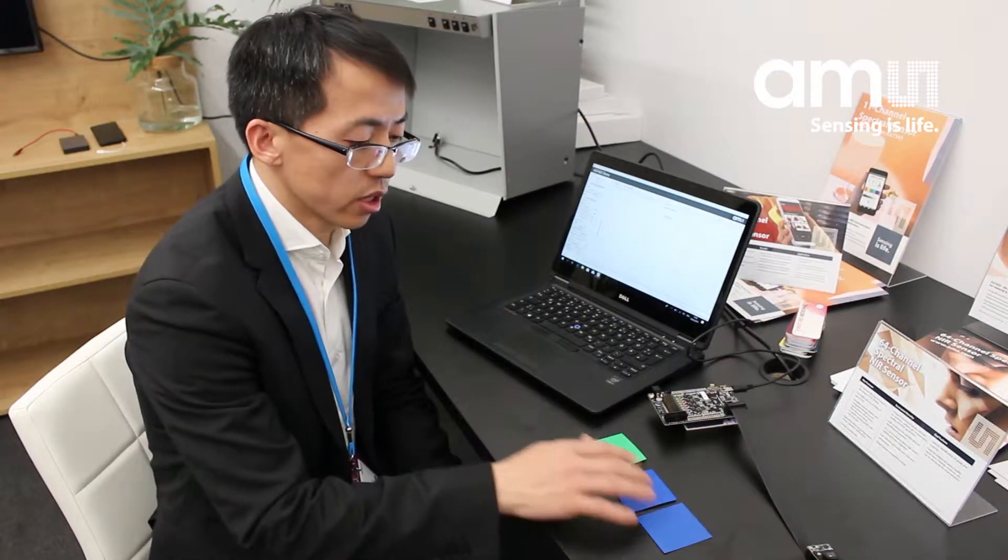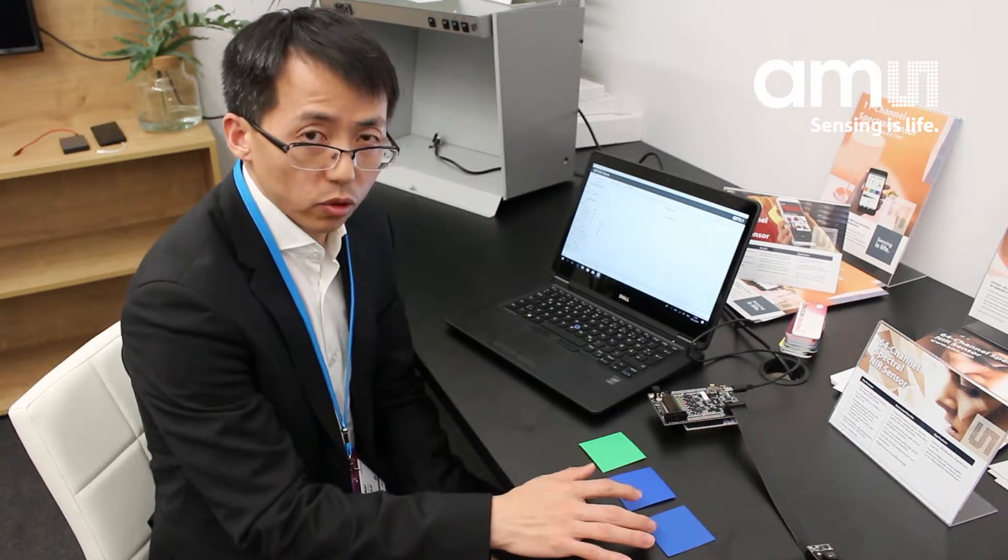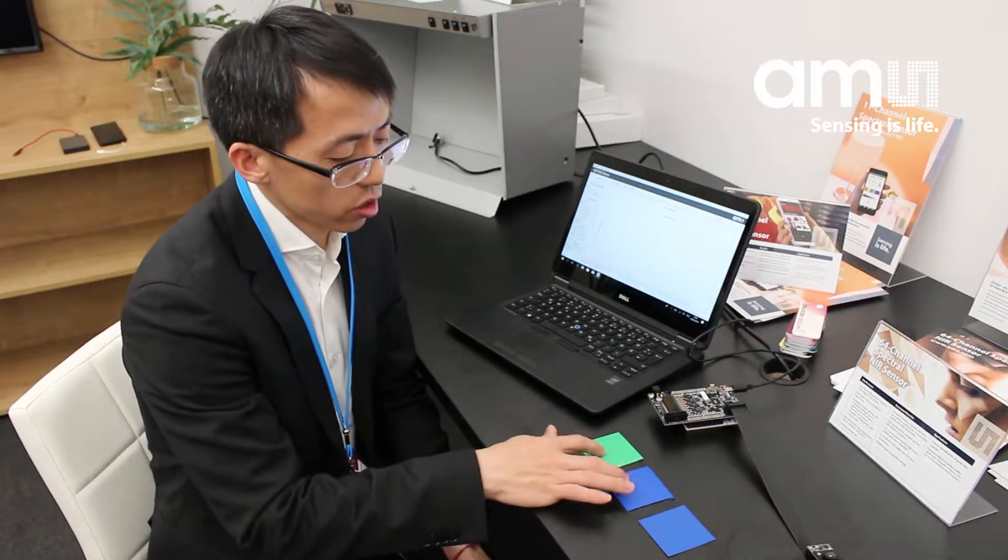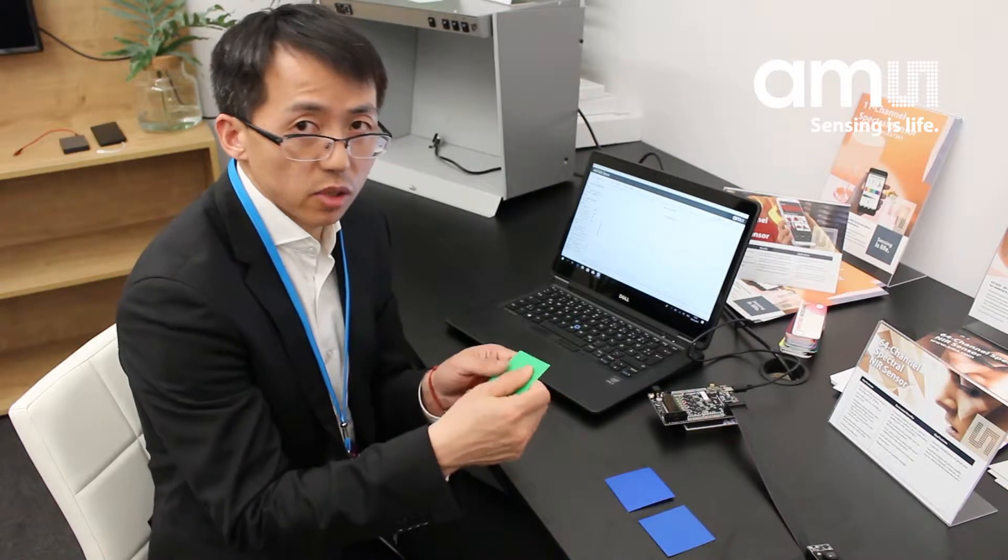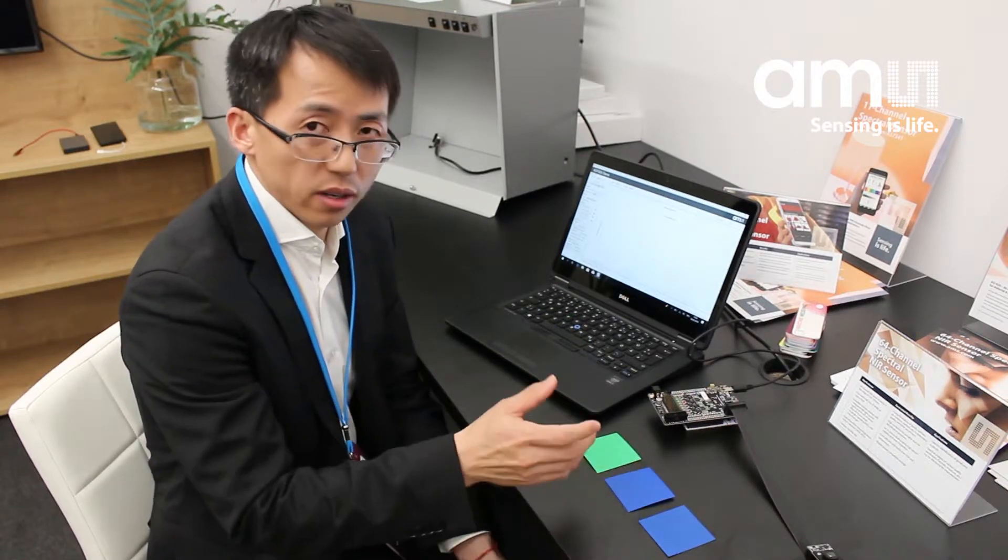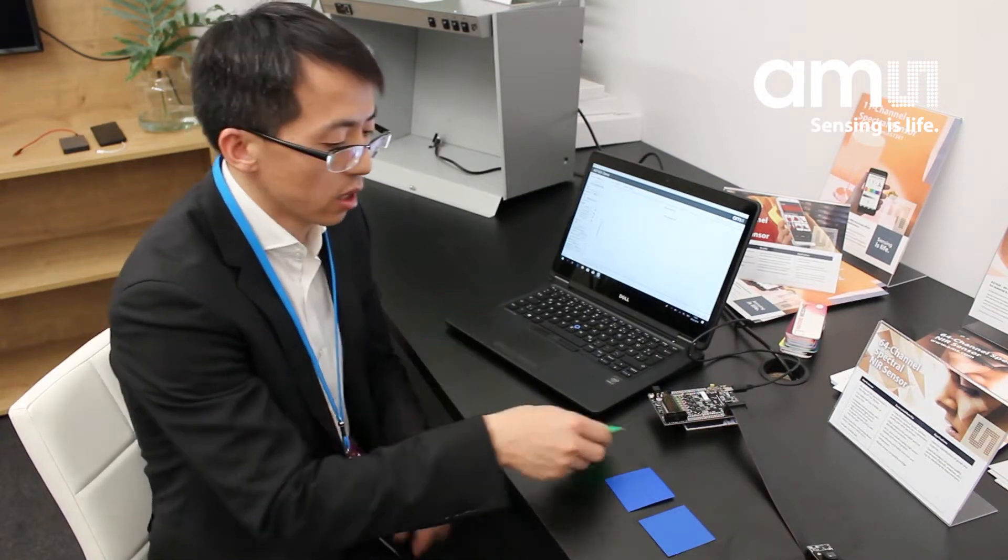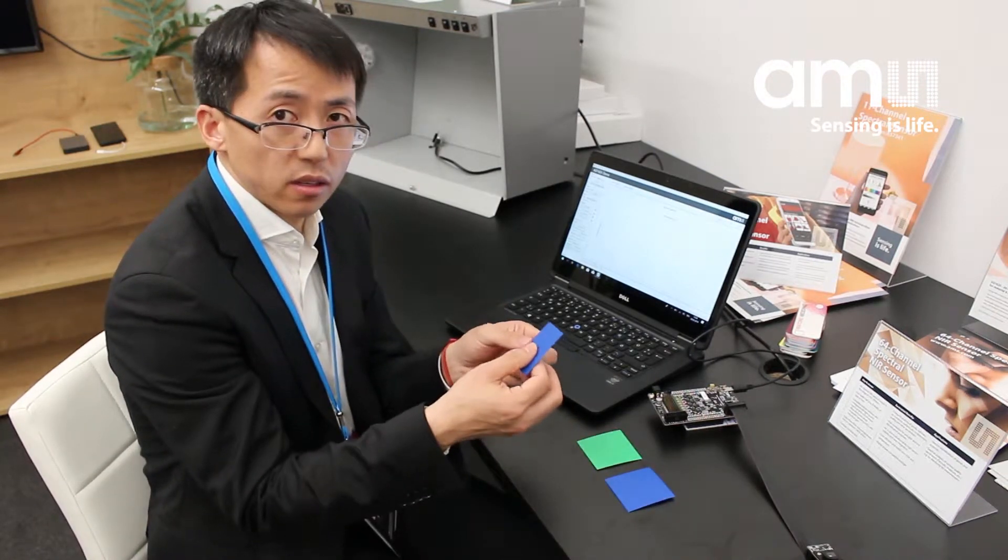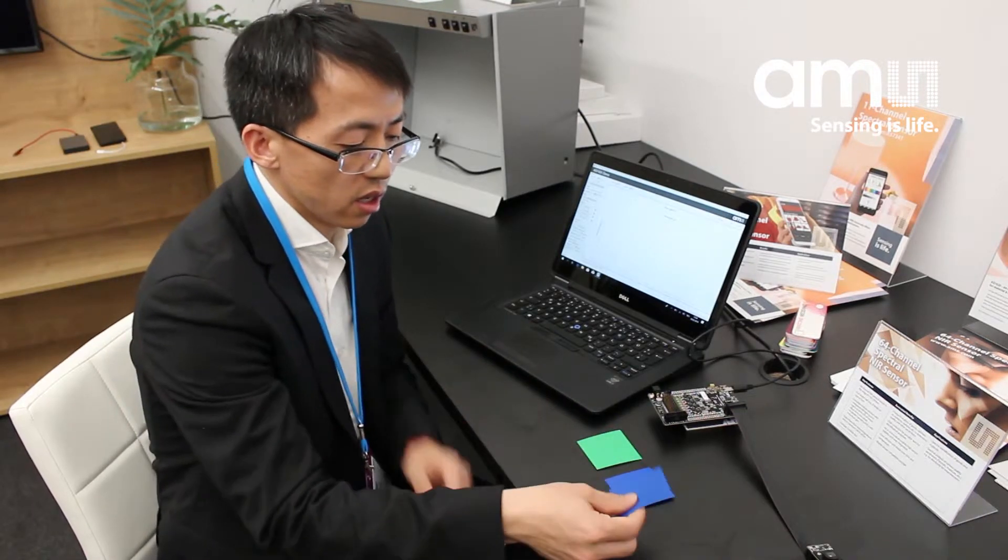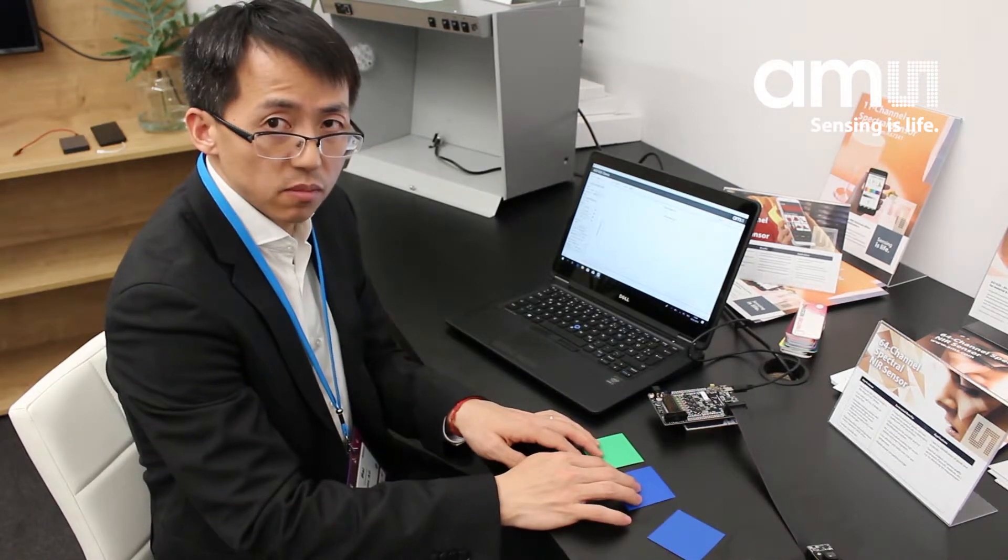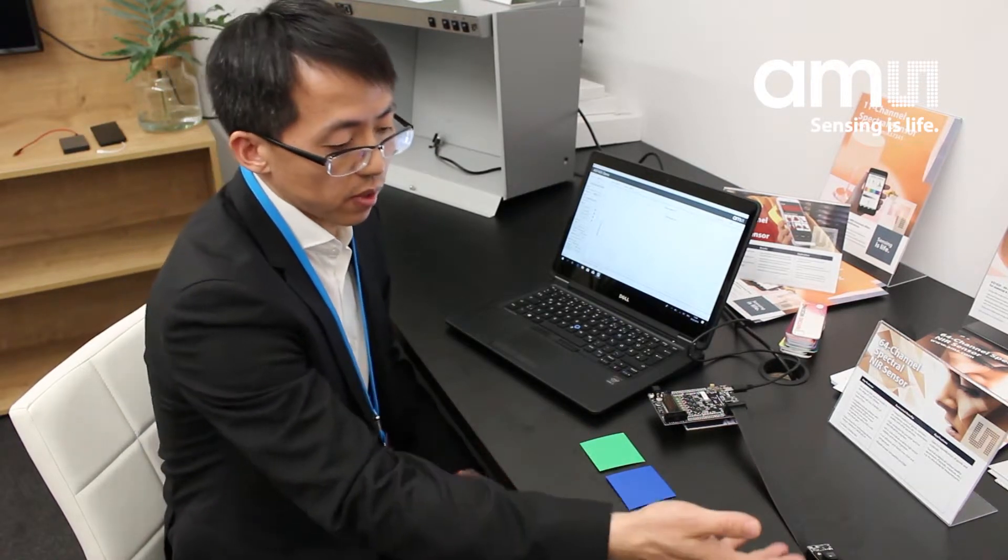You see here three cards: two are blue, one is green. Those two cards, if you touch them, have a similar texture and both are kind of hard, hard to bend. This one is very soft, very thin, and though it's blue, you may think those two use the same material. This is not so.